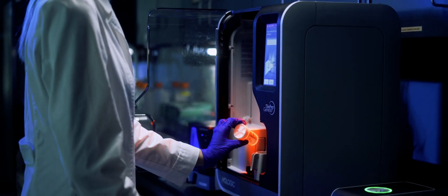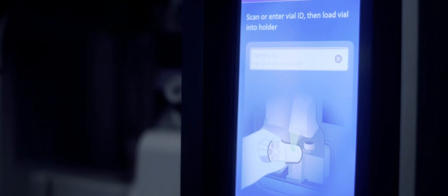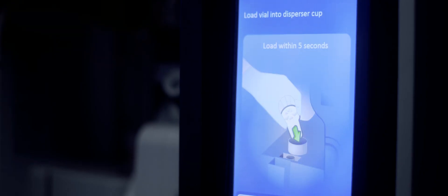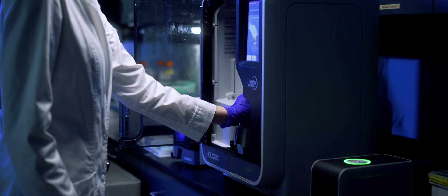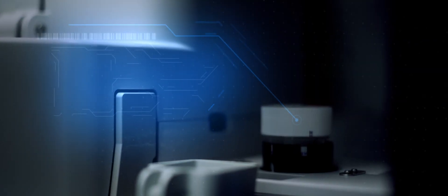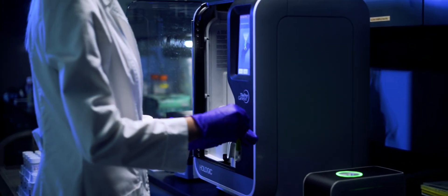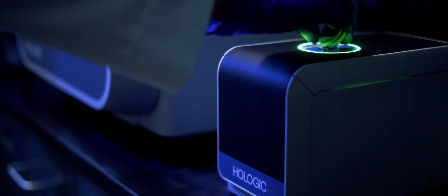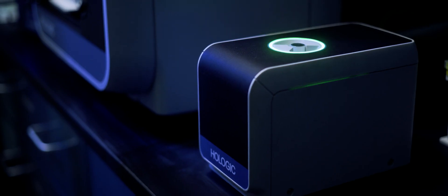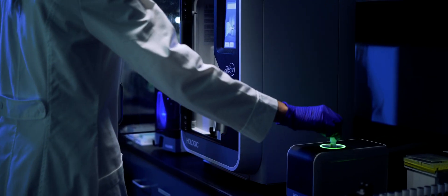Introducing the ThinPrep Genesis, the breakthrough advance in lab efficiency and workflow automation. The ThinPrep Genesis makes maintaining chain of custody as easy as a simple scan with optional slide and tube printers, supporting the end-to-end integrity of every patient's results and eliminating tedious hand labeling.